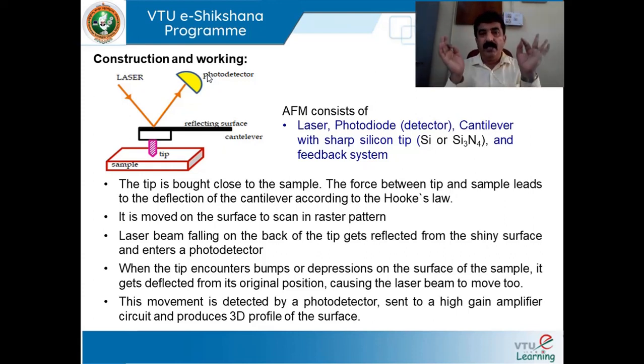So dear students, the AFM works on the principle of cantilever and of course Hooke's law. It is called atomic force microscope because the tip of the probe is of atomic size. Force microscope because the tip is moving down and up because of the force, and that force is provided by Hooke's law. Hence it is called the atomic force microscope. So this is about the construction and working of different instruments.